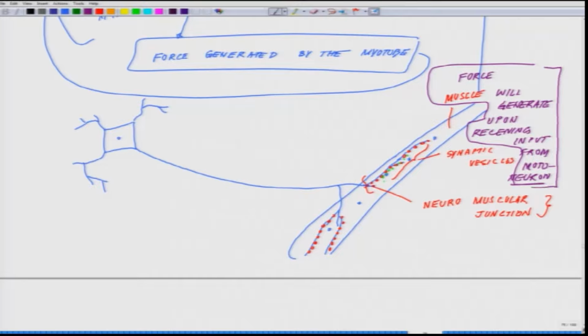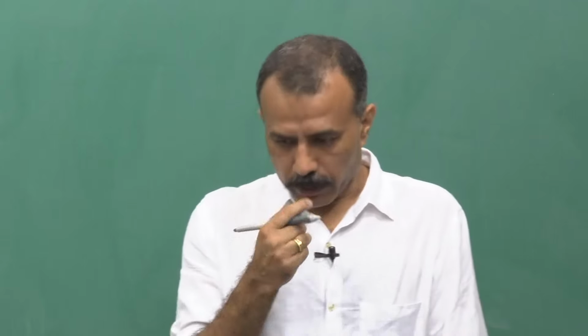now we are opening a little bit more complexity, where you need to have two different cell types in a culture dish or integrated on top of a micro cantilever. I will come to that.